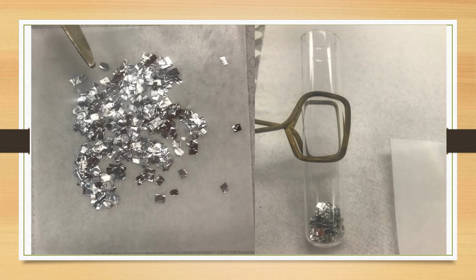Tear the aluminum foil into very small pieces on the weighing paper and place the pieces into a small test tube by folding the weighing paper. Now use the test tube tongs to hold the test tube and transfer to the next stage.